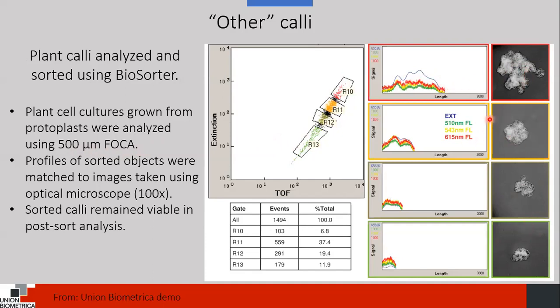I wanted to show these images because these are bright field images, the kind of bright field images that the COPAS Vision collects. These are not images from COPAS Vision, but we are looking forward to getting a chance to do experiments with calli to be able to do something like this. And you can see, again, that you can collect calli of all kinds of different sizes and shapes. And that would allow you to parse out this population into calli of different sizes.